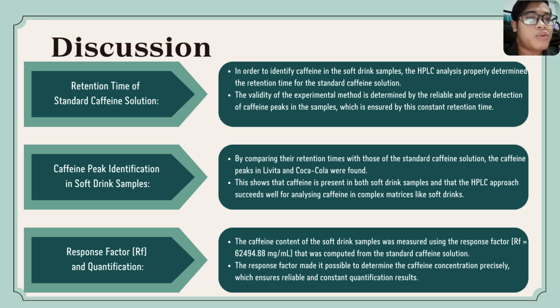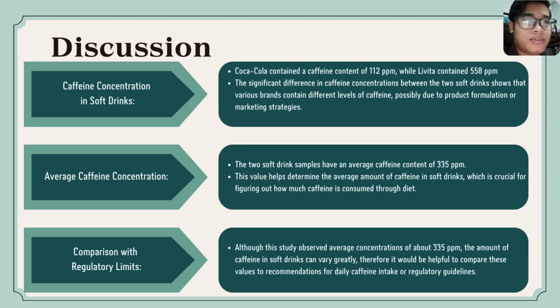The third one is response factor, or RF, and quantification. The caffeine content in the soft drink samples was measured using the response factor RF equal to 62,494.88 mg/ml that was computed from the standard caffeine solution. The response factor made it possible to determine the caffeine concentration precisely, which ensured reliable and consistent quantification results. Next, we move to the caffeine concentration in soft drinks.